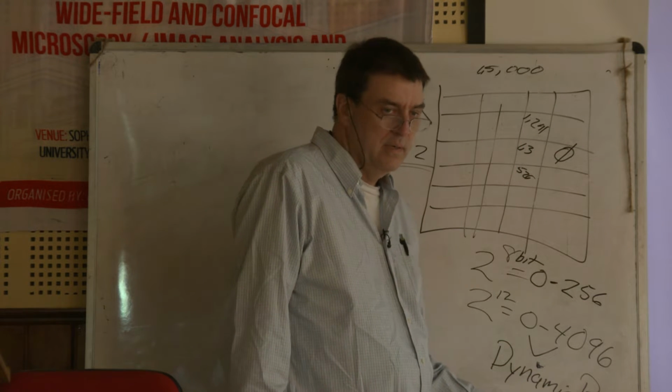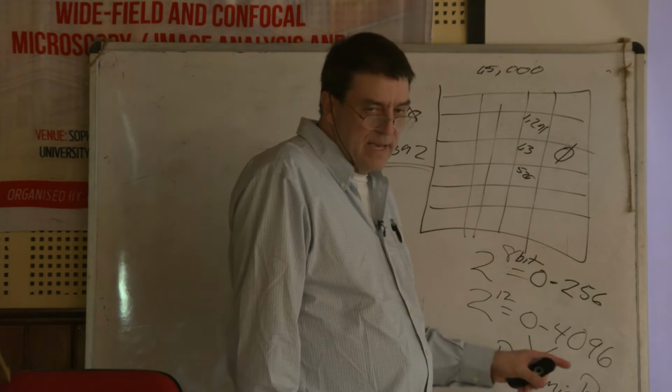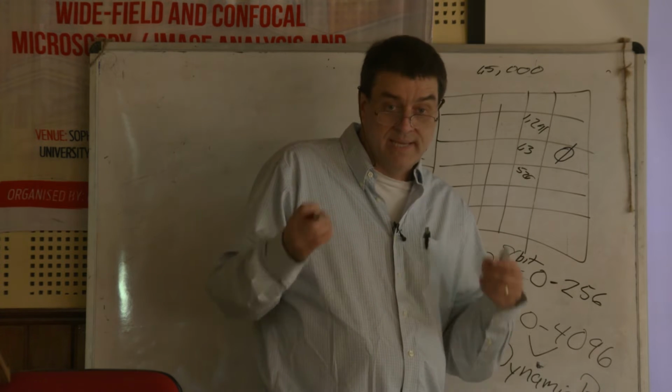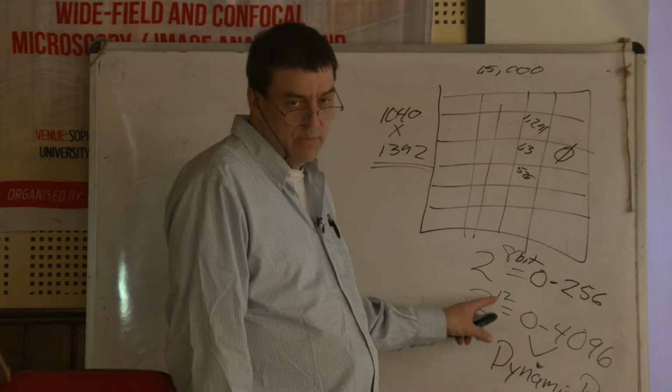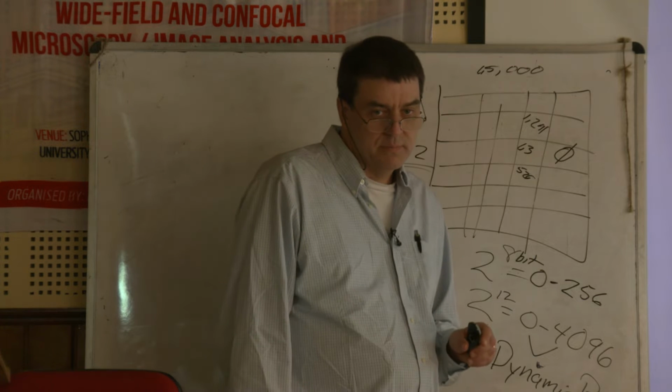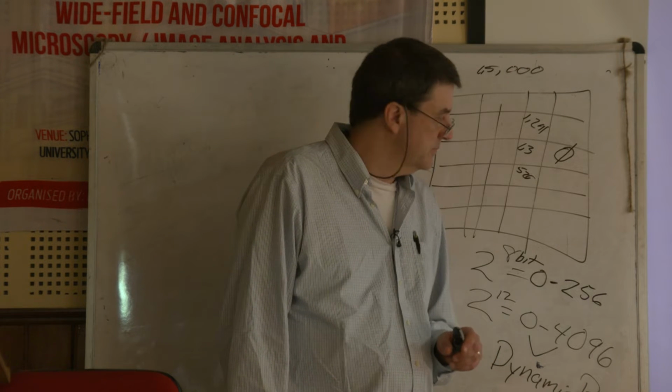Anytime you decide you want to do intensity measurements in microscopy, make sure you're working at least at 12-bit. So that's sort of the take-home message of that.